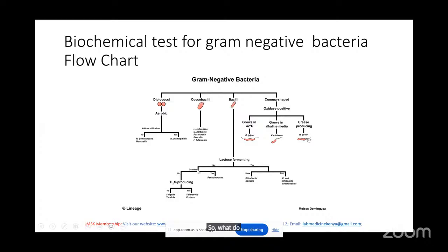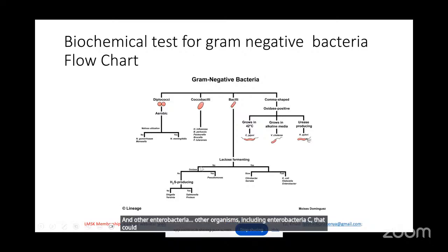Oxidase test to differentiate between Pseudomonas, which is positive, and other organisms, including Enterobacteriaceae, that are oxidase negative, and then you'll proceed with other biochemical tests to help you narrow them down.